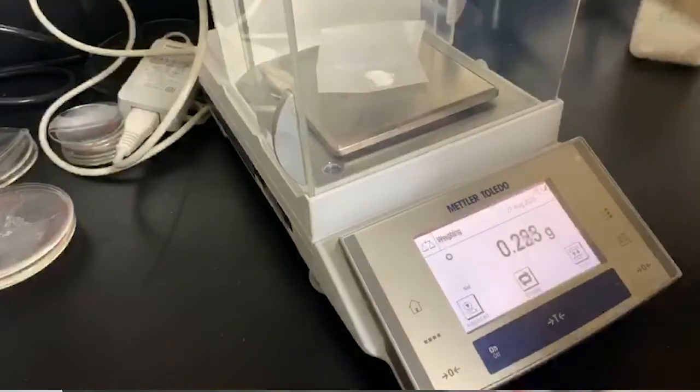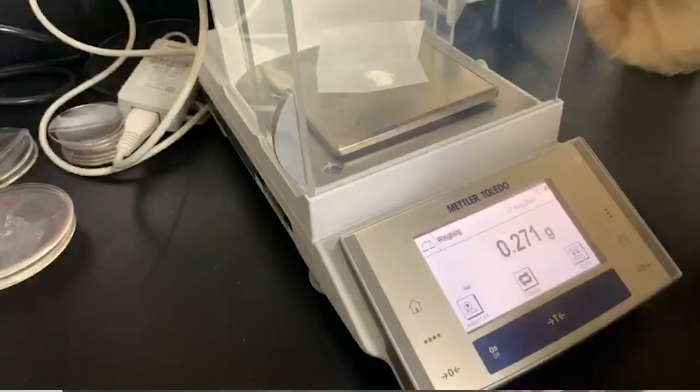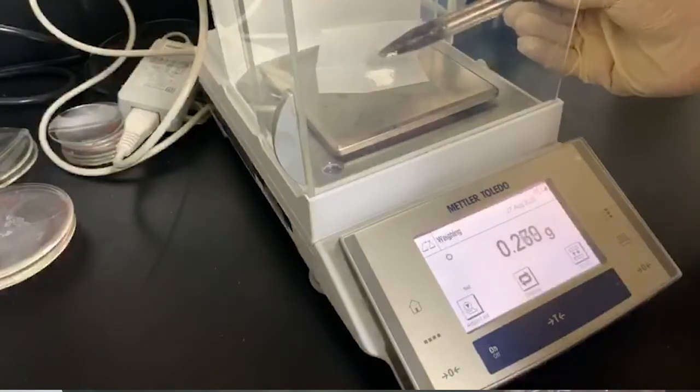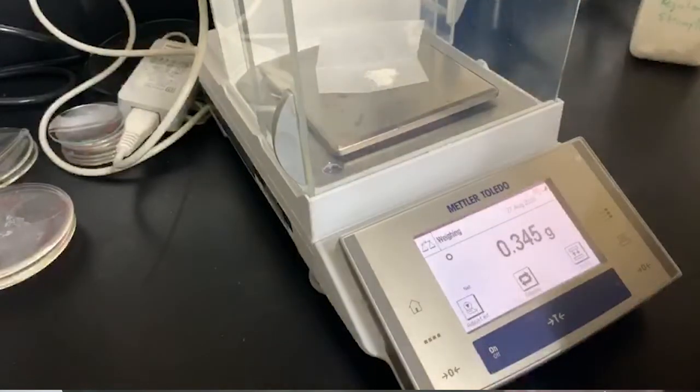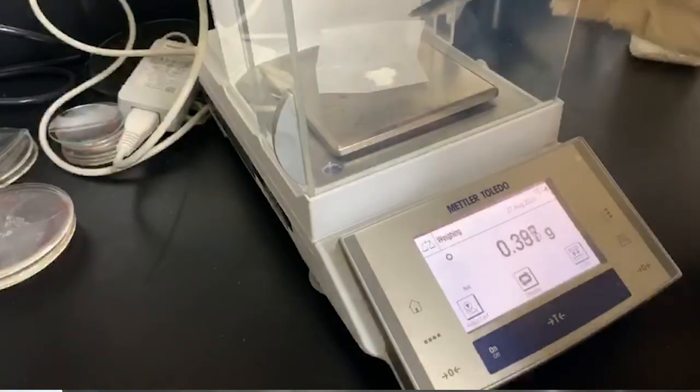One of the reasons we need a little bit more of our antacid tablet than we did of our sodium bicarbonate is because there's some binding agent that's inert in each of the tablets. So we need a little bit more in order to achieve the same neutralization capacity.